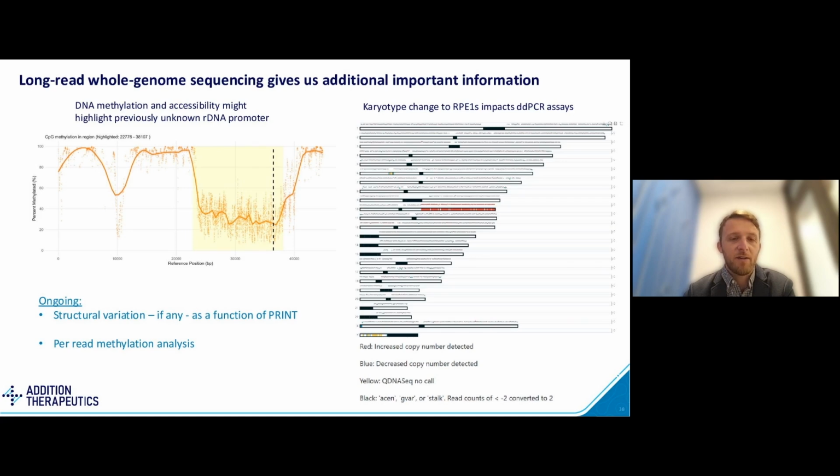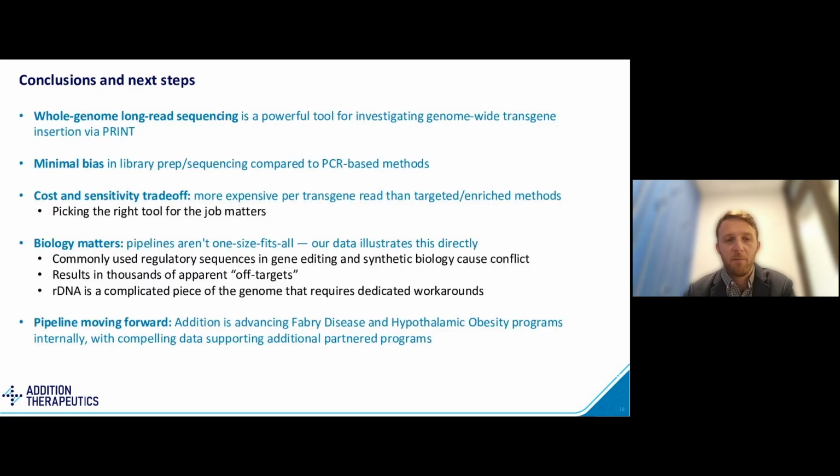And then we're also trying to look at per read methylation to get at a little bit of what are the accessibility requirements for the R2 retrotransposon.